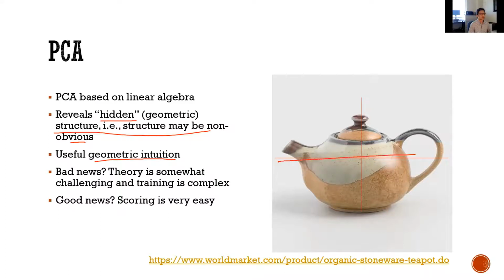So you create a new trajectory, using a new coordinate system to display the variability among your data points. You have one data point here, and you have another. This is almost the longest distance you can find among the data. There are endless possibilities you can show people using different angles, but this will present the largest variability among data points. So that's the idea of PCA.